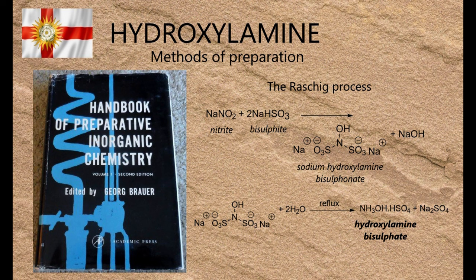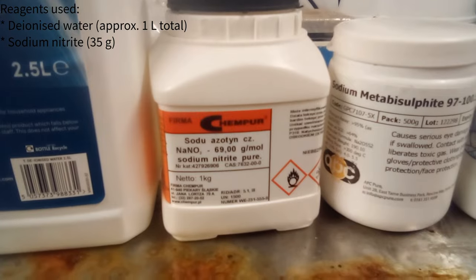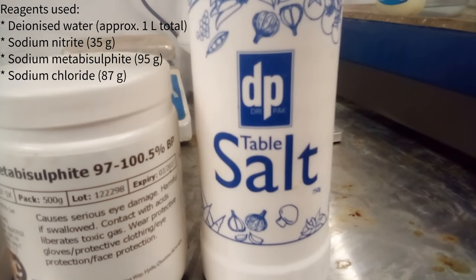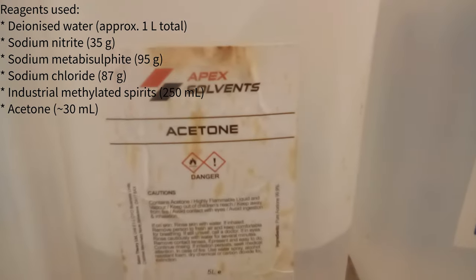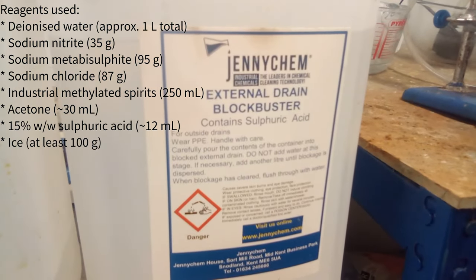In this video I'll be preparing it on a half-mole scale, which is relatively large for reasons you'll find out in due course. The reagents used were deionised water, sodium nitrite, sodium metabisulfite, sodium chloride, industrial methylated spirit, acetone, 15% sulfuric acid, and a lot of ice.